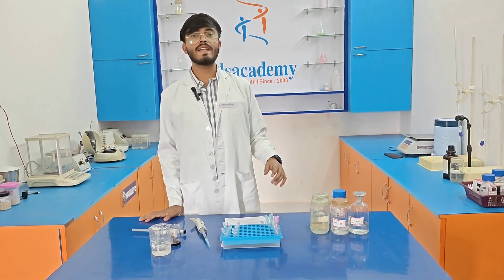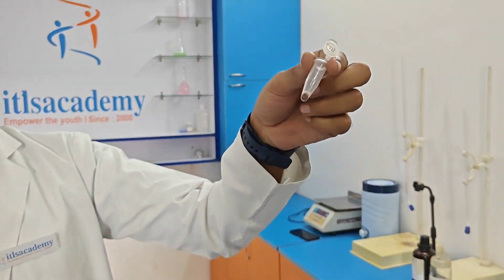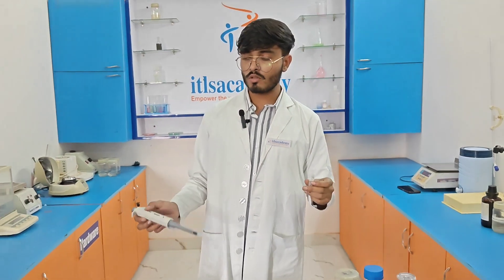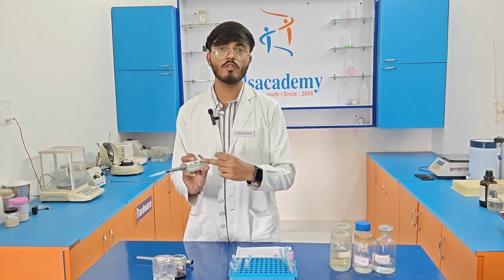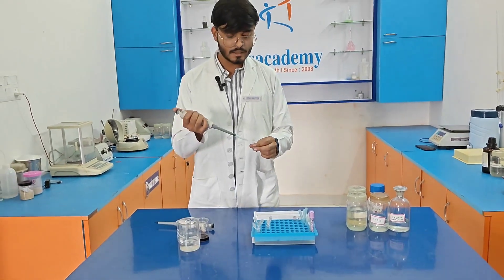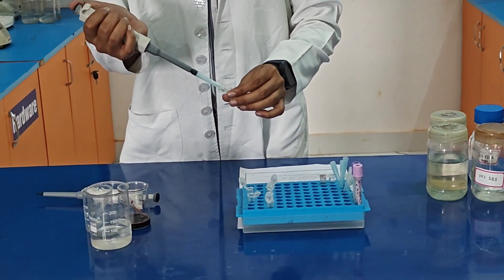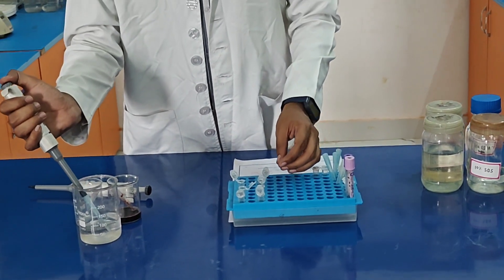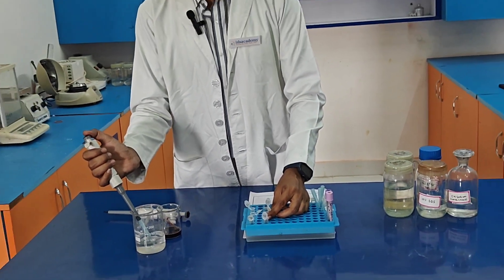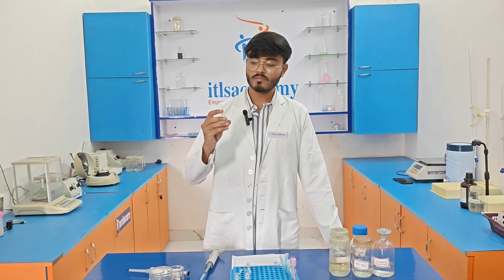After performing centrifugation at least 3 times, we now have pellets in the eppendorf tubes. We discard the supernatant very carefully. Then we add 400 µl of distilled water to each eppendorf tube and mix it with the pellets very carefully to dissolve them. We then perform centrifugation at 11,500 rpm for at least 5.5 minutes, after which we discard the supernatant again.